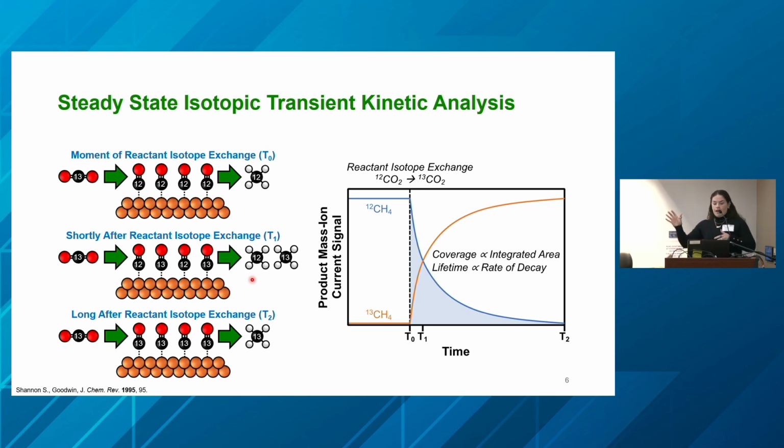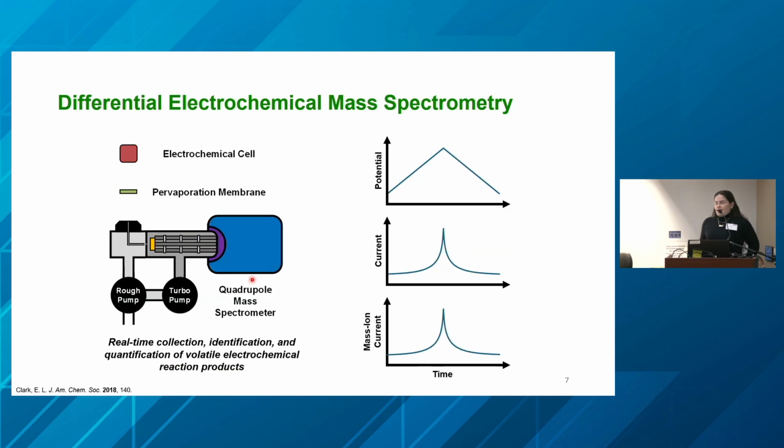But overall, this specific technique of measuring the coverages and the lifetimes of reaction intermediates has never been performed before in electrocatalytic systems due to the complications of product analyzation in an aqueous environment. And now these challenges can actually be alleviated through differential electrochemical mass spectrometry.